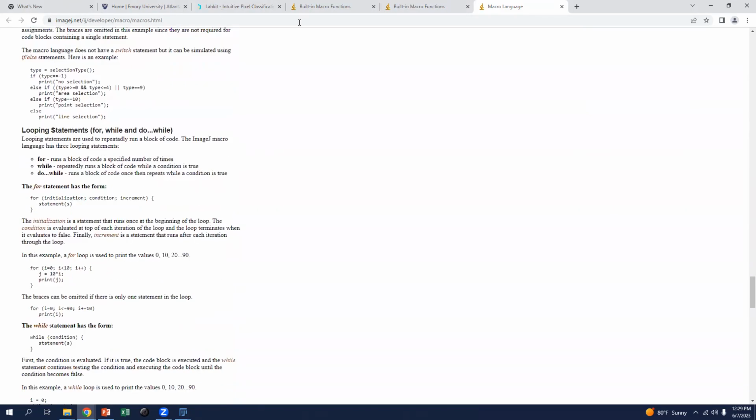But that's it for the lecture. So any questions in terms of potential applications or functionality while you have me here?